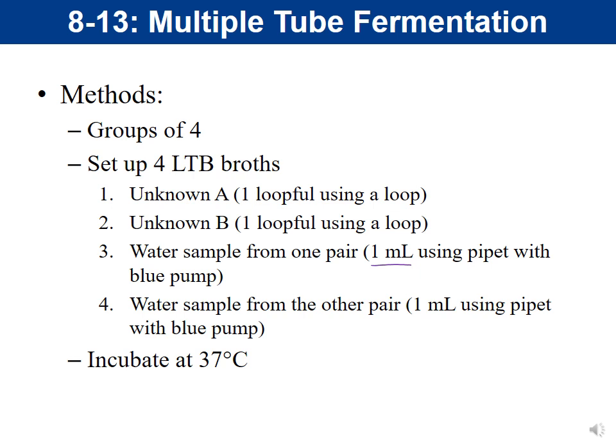You would take your 4 tubes with your LTB broth, you would put them into our can, and then you would put your can in the incubator and incubate at 37 degrees Celsius. And in our case, we do this for 48 hours.